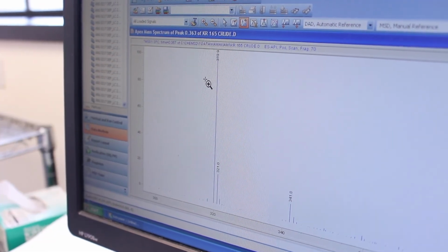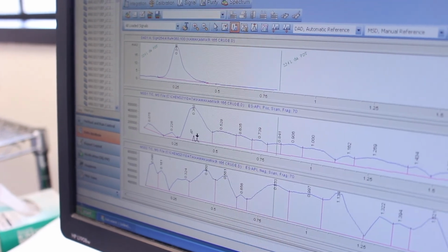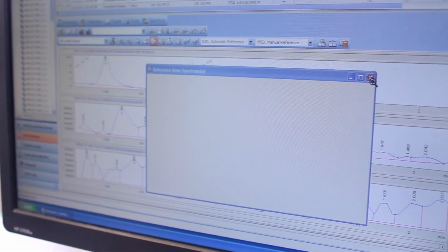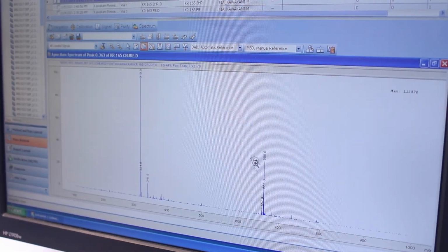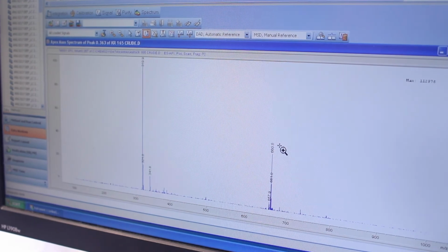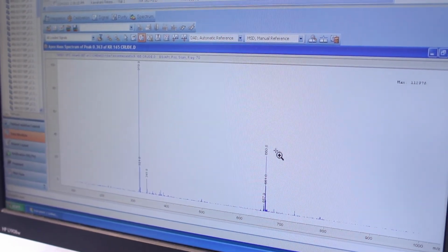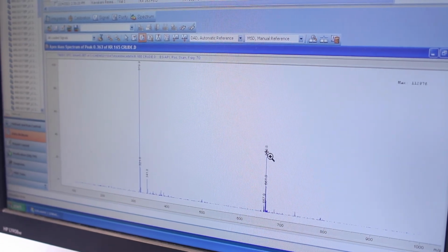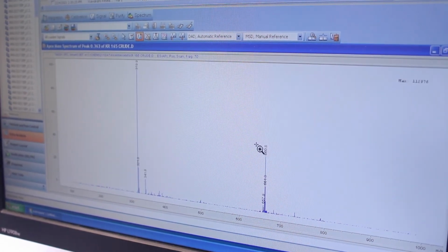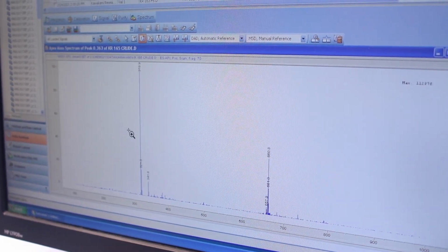So, okay. That said, if we close and reopen it again, you will notice that there is a little bit of an unknown peak. I'm not sure what this peak is, but it's right here at about 660. So I actually don't know what this peak is. It could be some sort of a dimer or an adduct. So sometimes molecules will partner up in the mass spectrometer and increase the mass. But suffice it to say that we have our product and it's fairly pure.